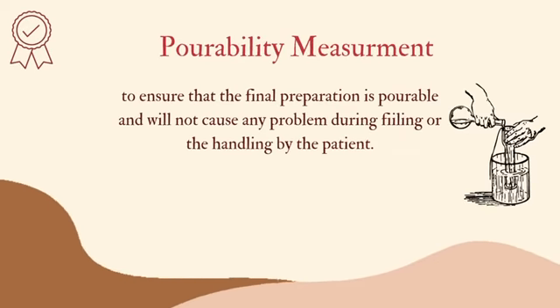Pourability measurement is used to ensure the pourability of the final product, so that it doesn't cause any problem during the filling or the handling by the patient.